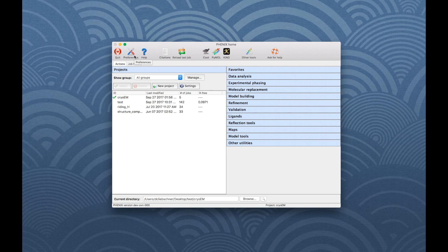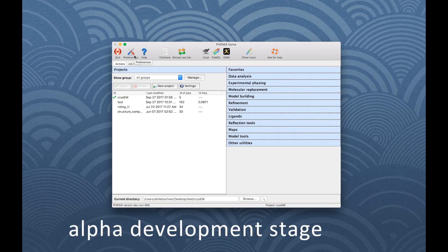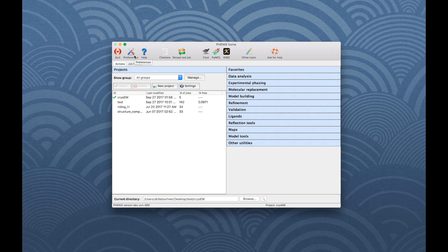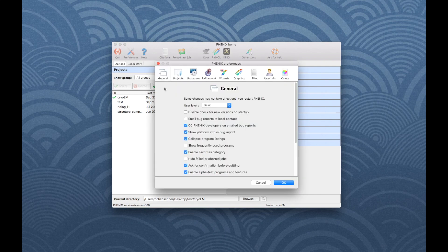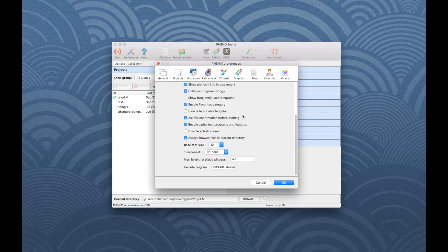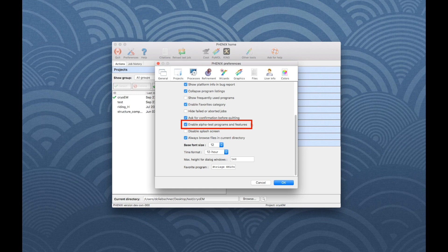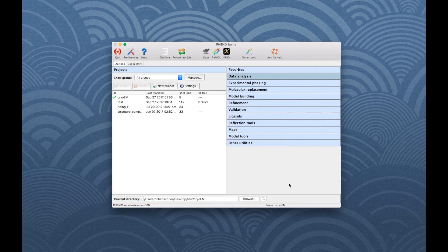The programs can be accessed via the Phoenix GUI, but the graphical user interfaces from Map to Model and Auto-Sharpen are currently in the alpha development stage and not visible in the normal user mode of the program. To activate the alpha mode, go to the Phoenix main window and choose Preferences. Under the section General, scroll down and make sure the box next to Enable alpha test programs and features is activated. You might have to restart the Phoenix GUI to activate the changes.